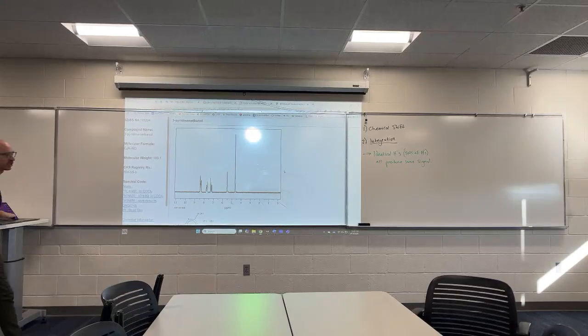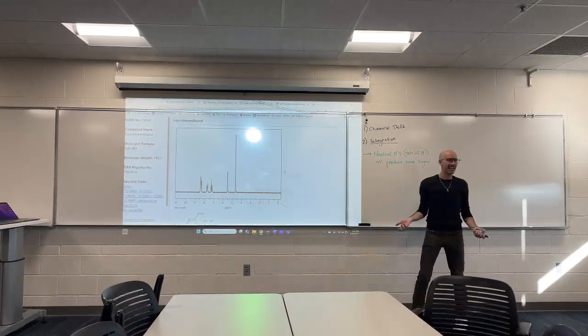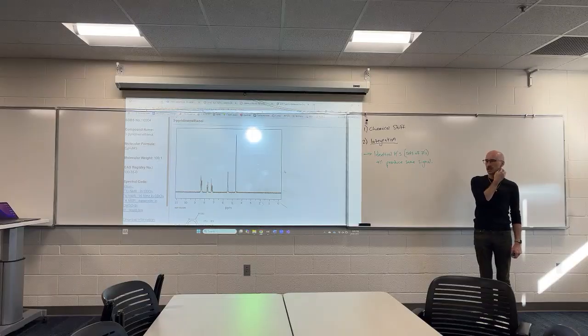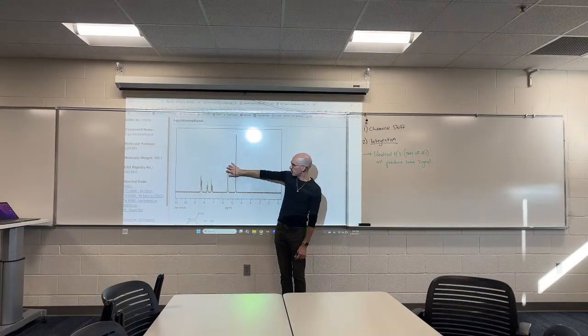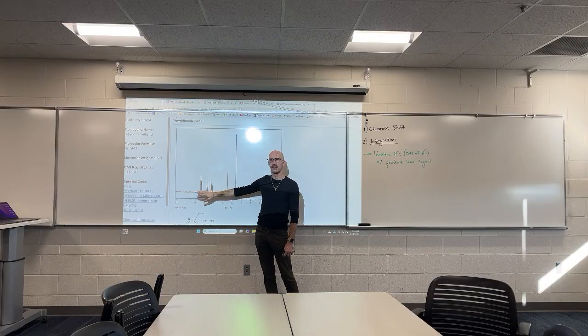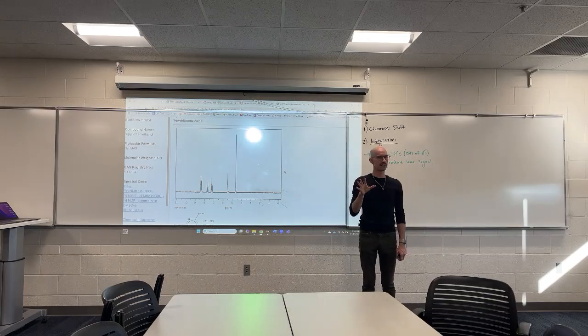And so if 2 hydrogens or 3 hydrogens are all in the exact same environment, they're going to produce the same signal. In fact, one thing that we can try to look for in certain molecules is unique sets of signals. Like here, I would say this is 1 signal, 2 signal, and then we've got clearly 3, 4, and 5. It looks like we've got 5 sets of unique signals.